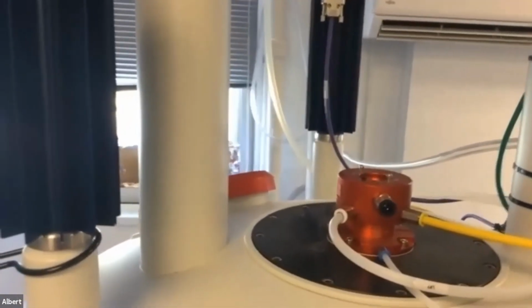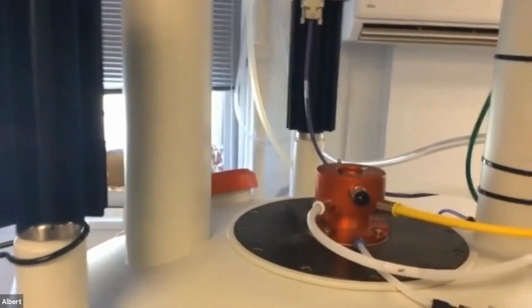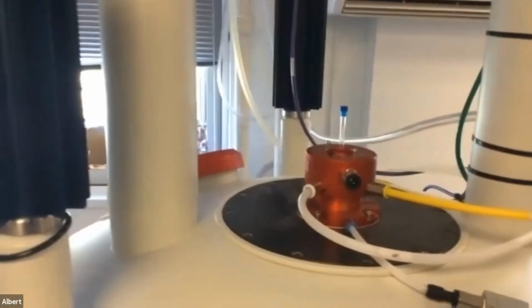And let's do the crude next. Because I want to show you, from the crude, how you know that there's leftover salicylic acid. So just take that, yep.